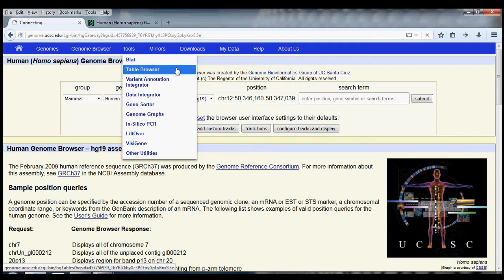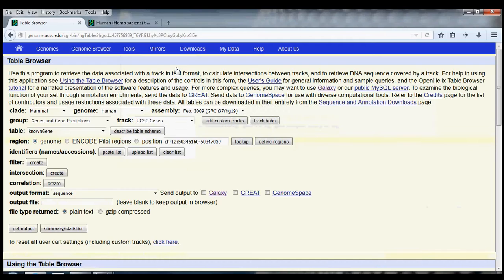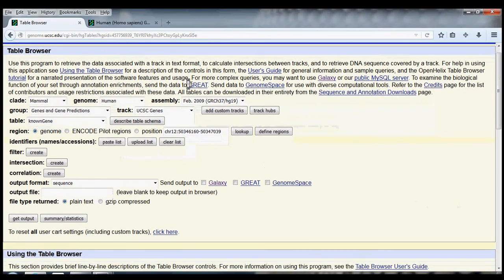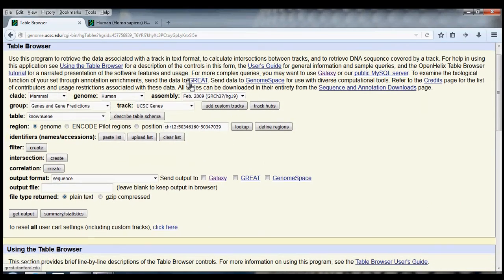Let's head into the Table Browser. We can see right away that the Table Browser offers us an immense number of features. I'm not going to be able to cover all of them in this video, but I'll try to give you some of the most frequently used features.